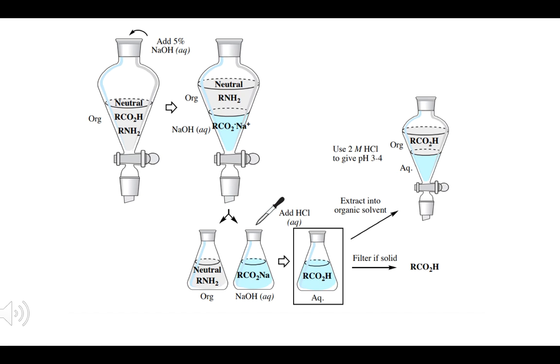It won't affect the amines. It'll deprotonate the carboxylic acid or the alcohols. They'll go into the aqueous phase, and you can separate them that way. And that's how you would separate it, by acid-base extraction.